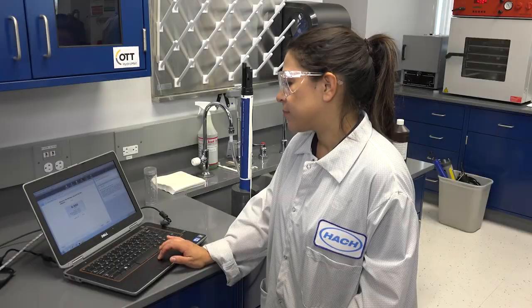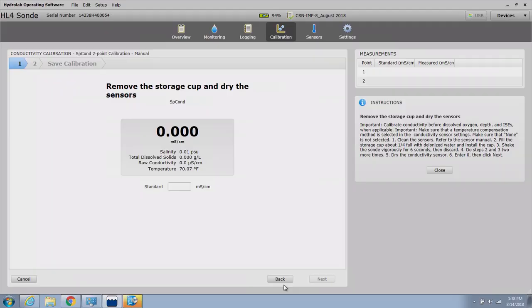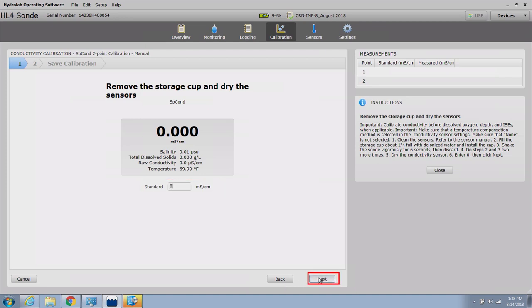Enter the number zero into the standard text box. Click Next to proceed. The stabilization process will begin and must complete successfully before proceeding to the second calibration point.